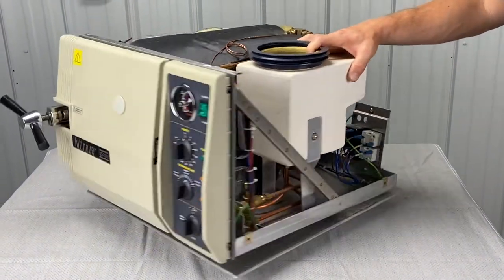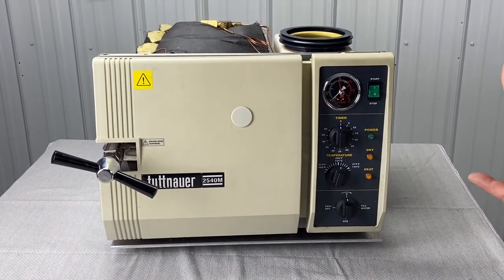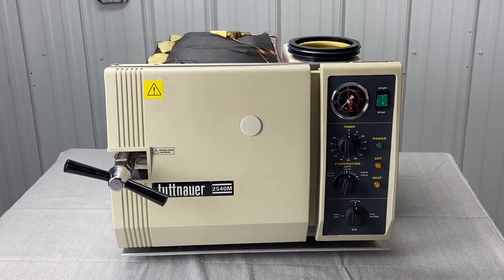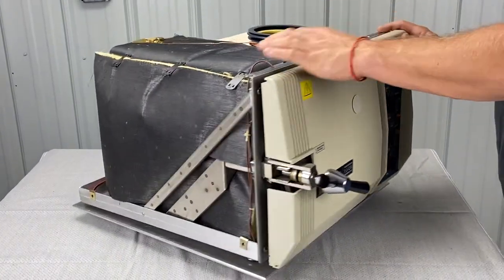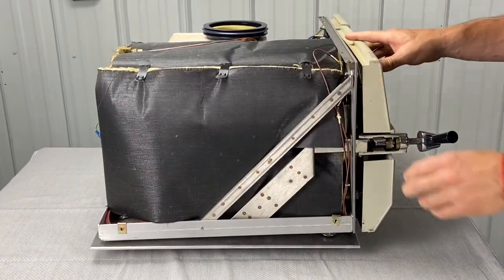That is how you take the cover off of a Tuttnauer autoclave. This is for Tuttnauer manual units: 1730, 2340, 2540, 3870 manual units. It's similar with the automatic units. For the EZ11 Plus and the T-Edge and these other units, you'll have to refer to a different video.